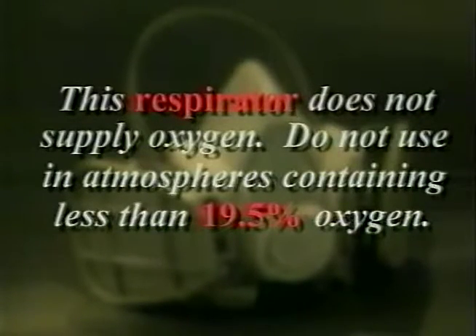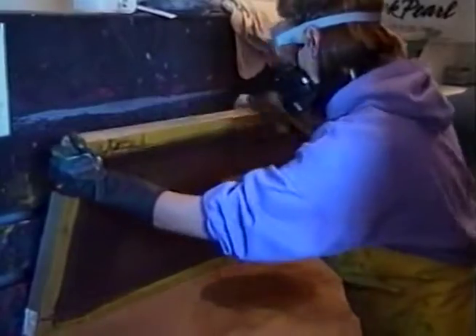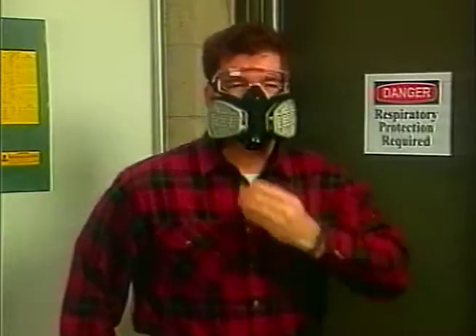Air purifying respirators should only be worn for protection against contaminants that can be detected by smell, taste, or irritation. This ensures that if the contaminants break through the respirator, the user will know right away. The exposure must stop and the respirator checked if the air contaminants break through.